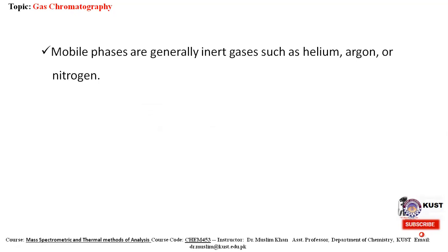So the mobile phase is generally an inert gas such as helium, argon, or nitrogen. They are inert so that the mobile phase is not interacting or reacting with the components to be separated.